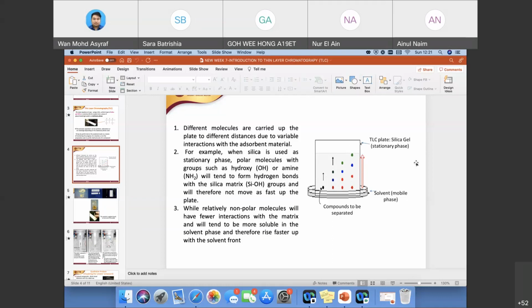All right. So silica gel. Now you need to know that silica gel is a polar compound. So it is for the separation of, you remember the like dissolves like principle, for a polar stationary phase. It is the separation of polar compounds. So in this case, in these dots, which one is the most polar compound? Pink, orange, blue, or green?